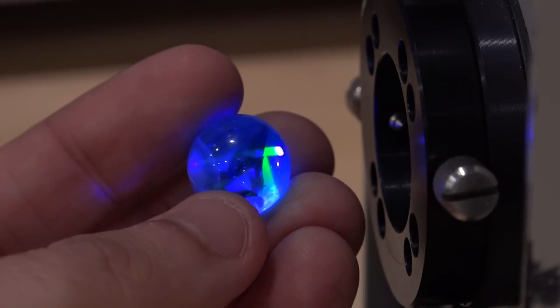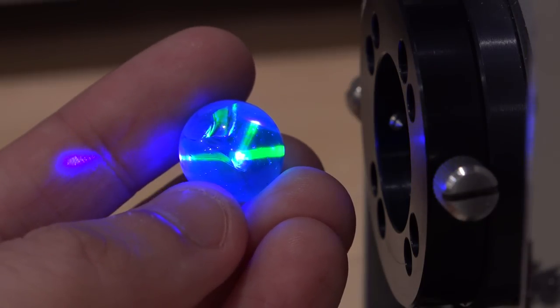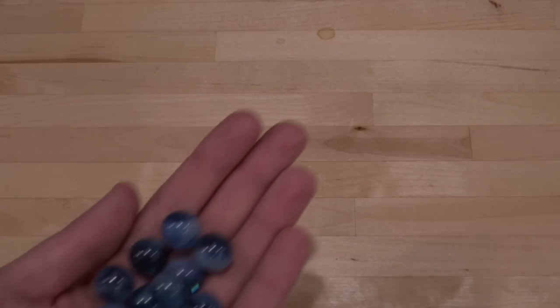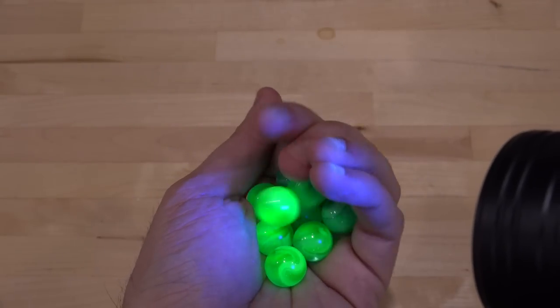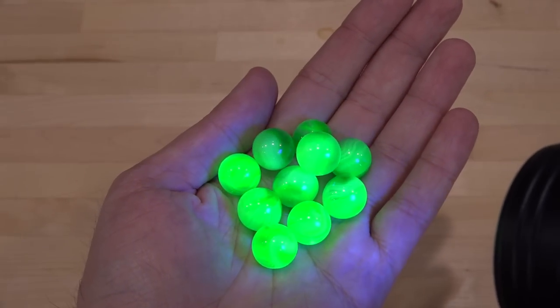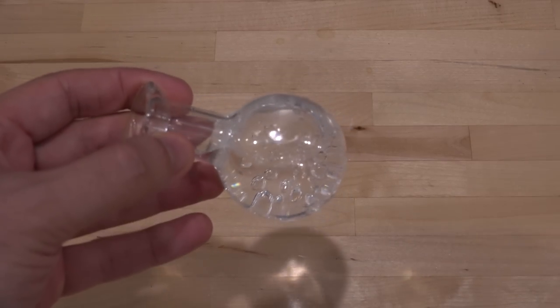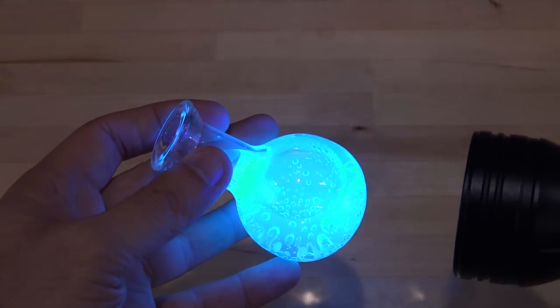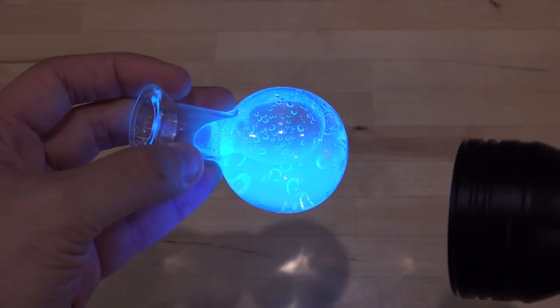There are some defects inside the marble that cause internal reflections, and you can see the beam refracting and breaking apart. This effect is really obvious because the wavelength shift is big — that's why I chose this material. You don't need a laser to see this effect. With a UV flashlight, you can clearly see very strong fluorescence with a big shift away from the actual wavelength of the UV light. The laser however lets us see that it only happens in the path of the photons. Here's a liquid sample that also fluoresces: tonic water has naturally occurring quinine in it, and that also fluoresces under light, though the wavelength shift is not as dramatic.